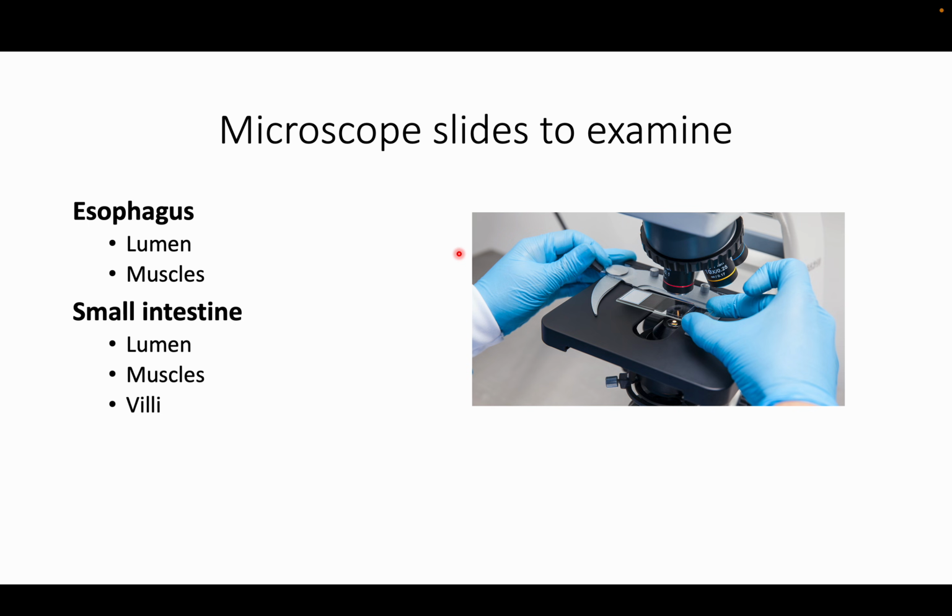When you are doing the dissection, please remember to also take a look at the slides of the esophagus and the small intestine as well underneath the microscope. So you also have to be responsible for identifying these structures as well on quizzes and exams.